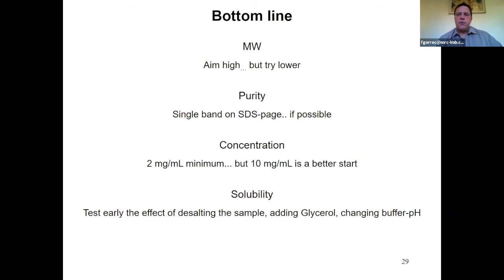Simply see the effect of adding glycerol as well in your sample. Maybe try 5–10% glycerol and see if it's making a difference. And also the buffer. Not a bad idea to try different buffer pHs and see what happens with that too.